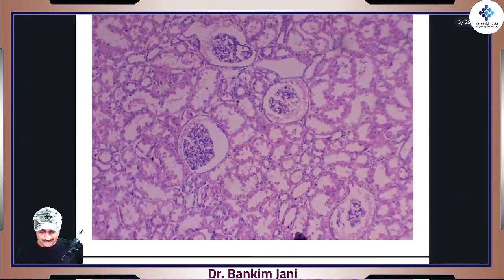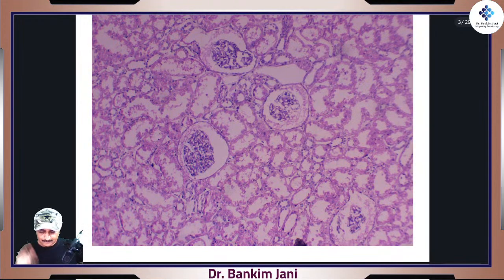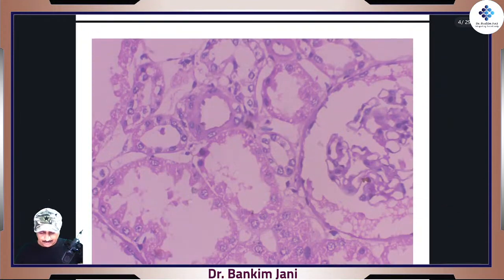So here, Bowman's capsule, and here are the ducts. Now see, you will watch suddenly that there are so many ducts.